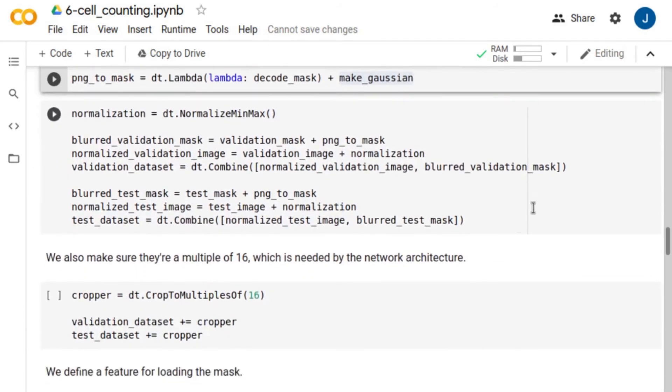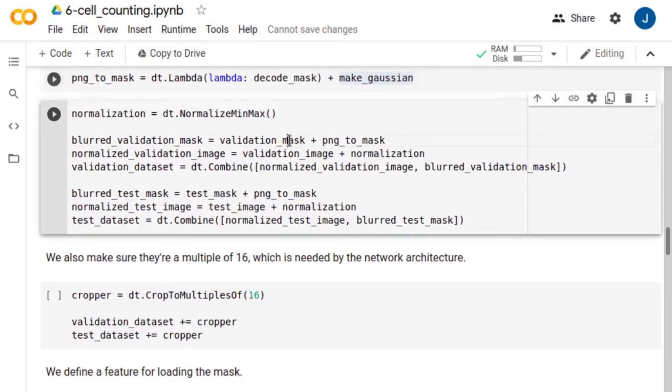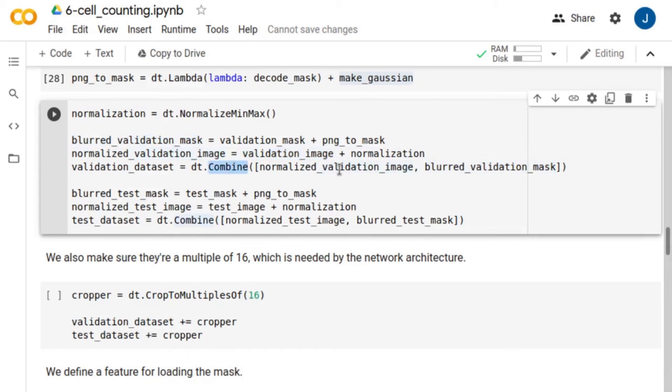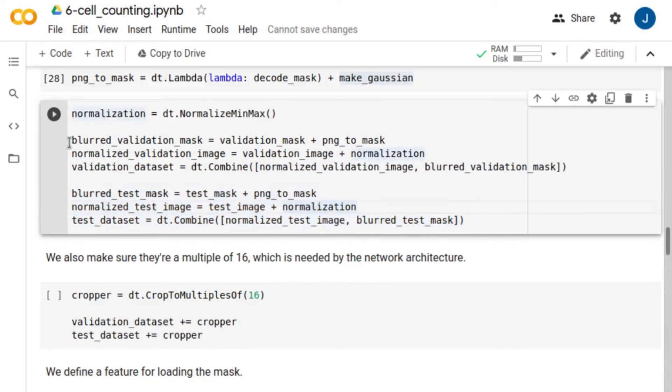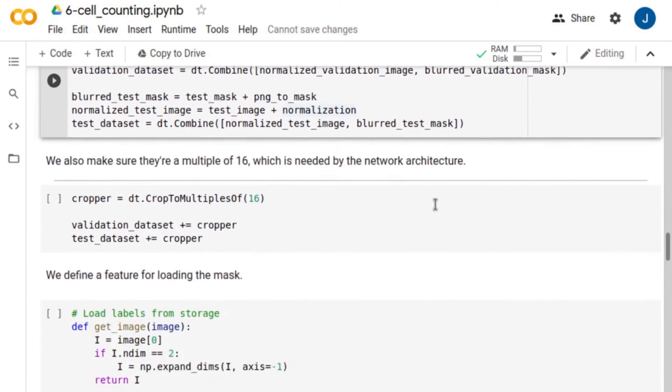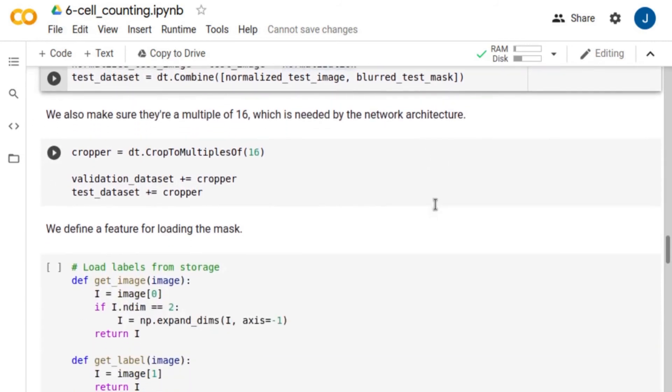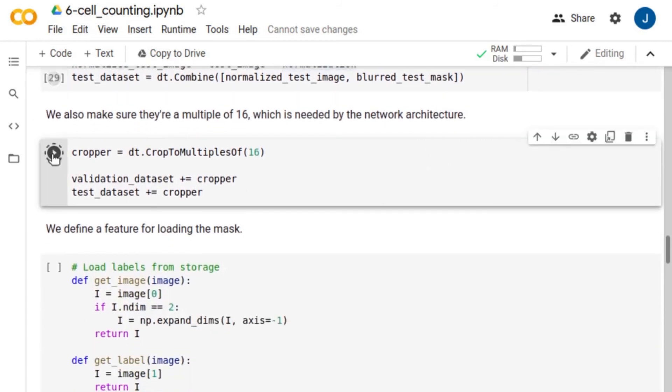We apply this pipeline to the validation masks and normalize the cell images between 0 and 1. Finally, we combine the normalized cell images and Gaussian labels into a single database. We do exactly the same for the test set. We also make sure that these images are multiples of 16, which is needed by U-Net.